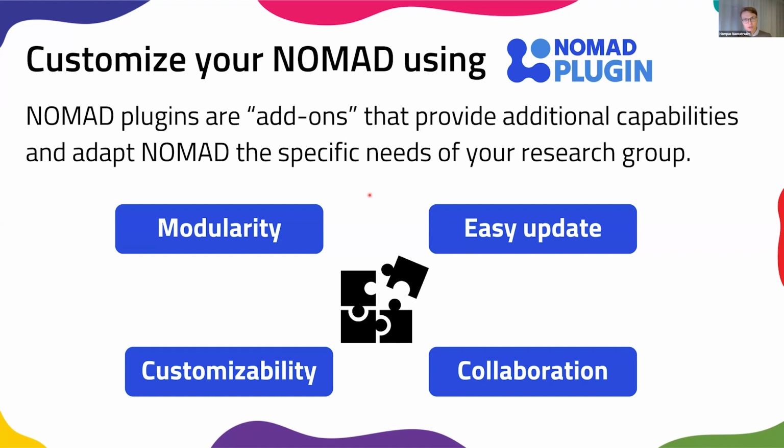So these plugins can then be published, and they can be used in other Oases, so that other people can make use of what you have done, the new readers that you have written for files, or parsers for files, or the new visualizations that you have developed. So there's a bunch of different ones that you can work on.